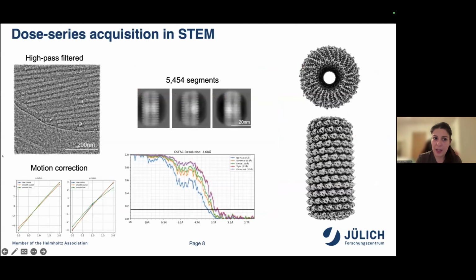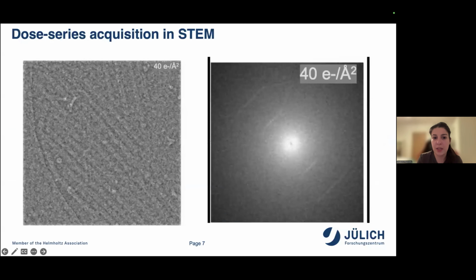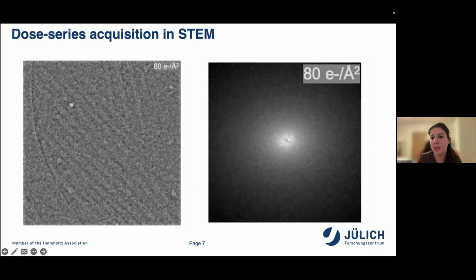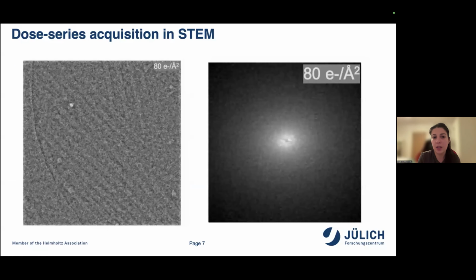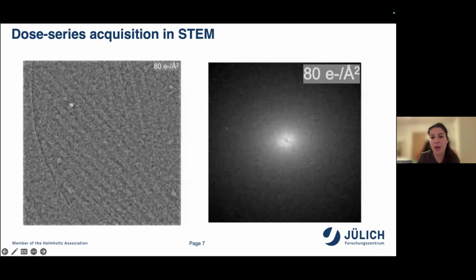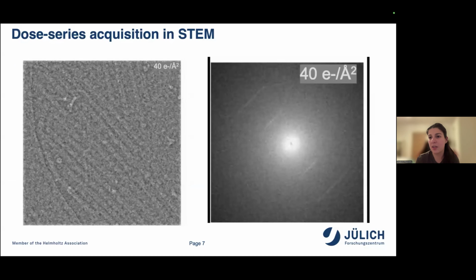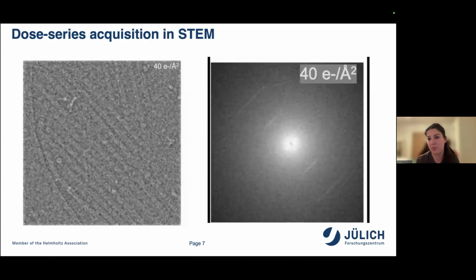No, I do not have this problem regarding the orientation. You can see, of course, there is a preferred orientation, but it's something that is also based on the ice thickness. But at the end, it's not something consistent. You can see different orientations in different movies, so yes.